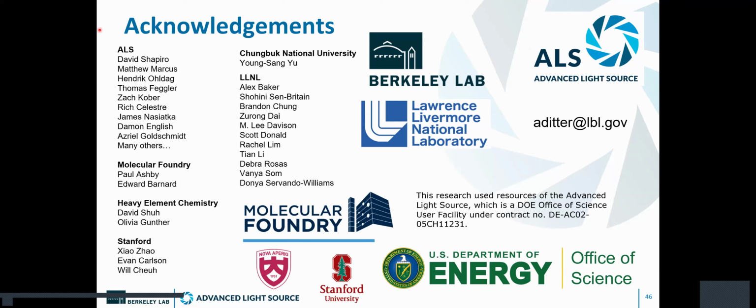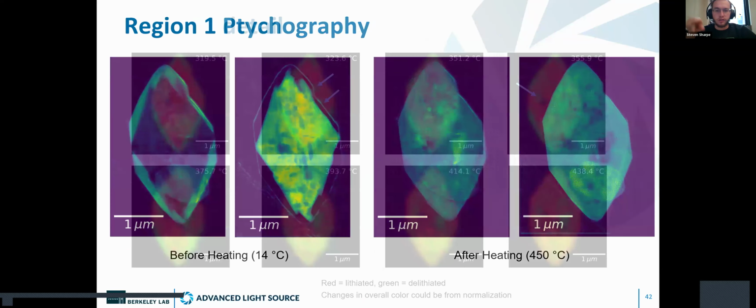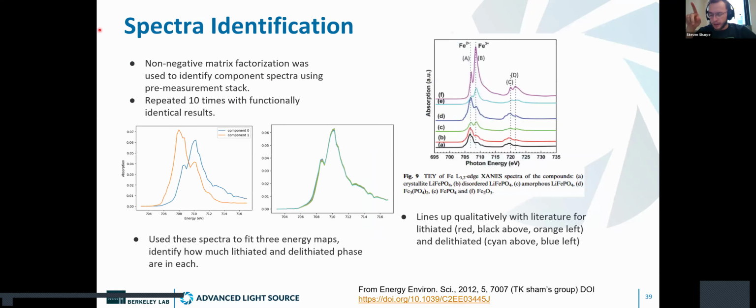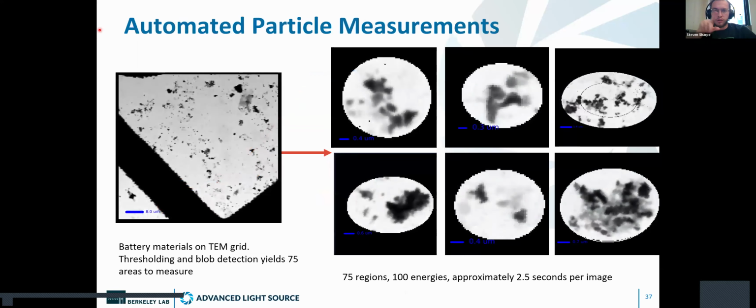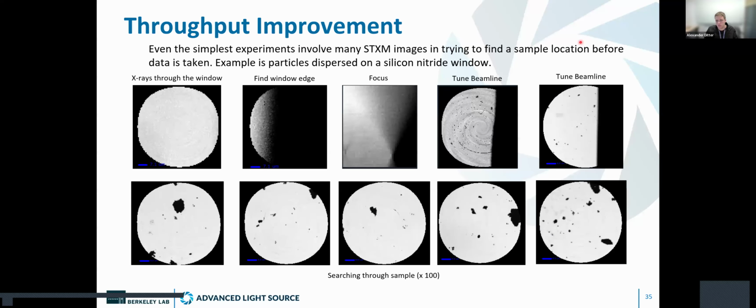On slide, I think 37, you showed the spiral pattern noise. Is there a way to remove that? I know with a raster scan, you're able to do a Fourier transform of the image. Not this slide, I guess. This one. Yes, that one. You're able to do a Fourier transform of the image to isolate the pattern noise. Is there a similar thing you can do for spiral scans?